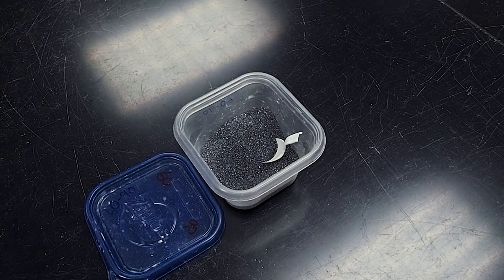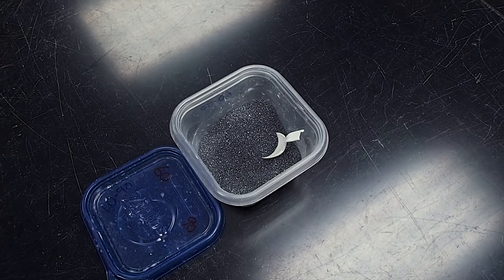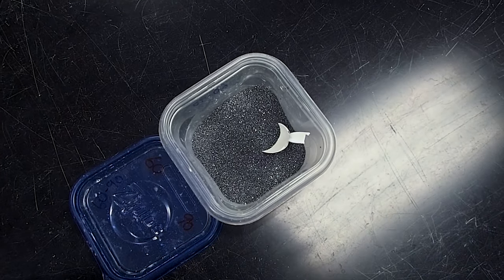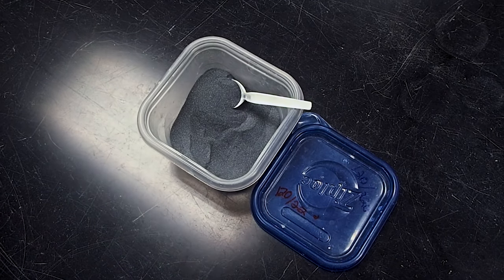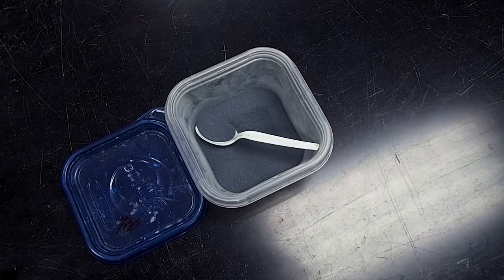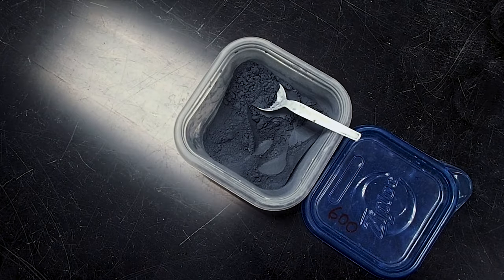In order to complete all of the polishing and grinding by hand, you will need at least four grit sizes: a coarse 60-90 grit, followed by a progressively finer grit such as a 120-220, a 400, and finally a 600 grit size.